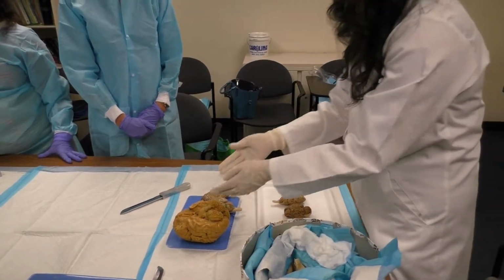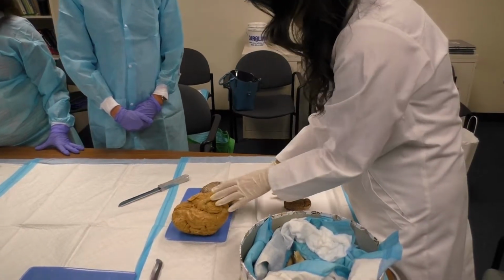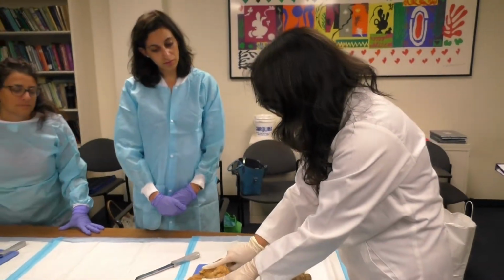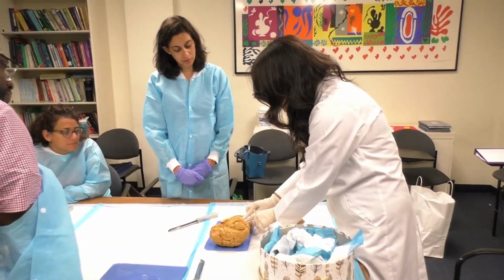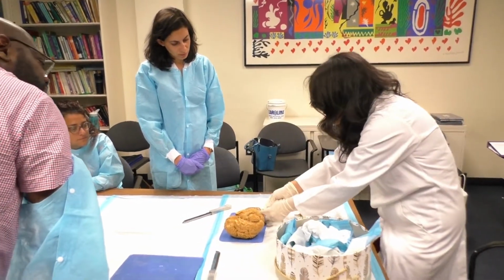One of the main differences between the human brain and the sheep brain is the configuration of the hippocampus. So in the human, it lays flat in the deep part of the temporal lobe right here. And in the sheep brain, it starts down here, but it curves up.